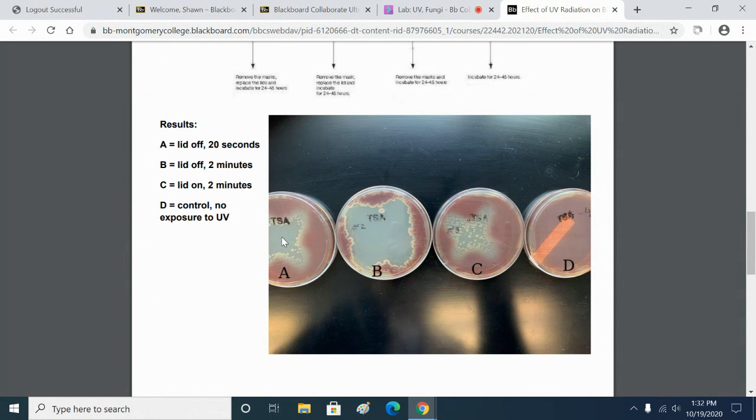So what could be going on in plate C in the kill zone? We had survivors. Are they normal? No, maybe because the colors for protection got burnt out from the light. Well, you're kind of sort of on the right track. The gene to produce pigment got mutated. It's no longer functional. So those bacteria survived, but they're mutants, and they lost the ability to produce the red pigment because of mutations in that gene.